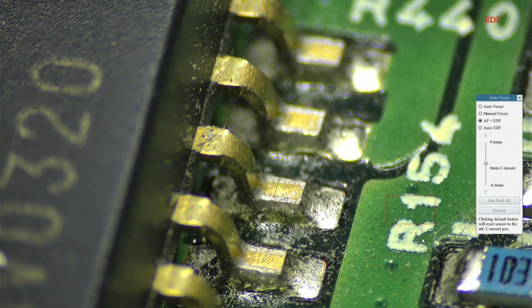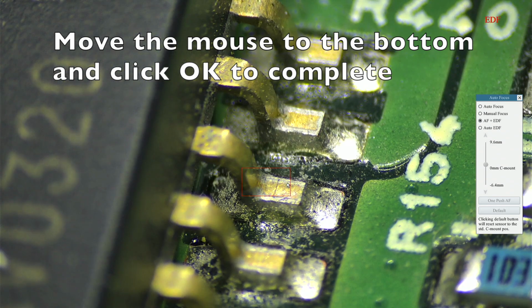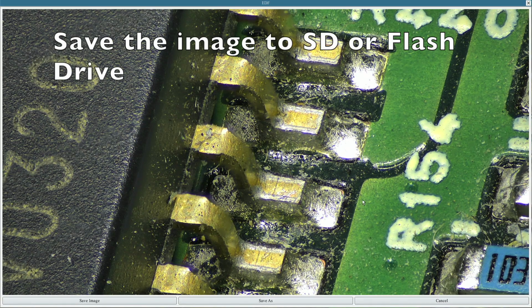When you are done, move the mouse to the bottom and click OK. This will produce a final image with the extended depth of field that's otherwise impossible. You can then save the picture to SD card or USB flash drive.